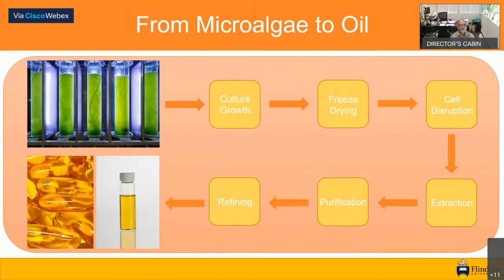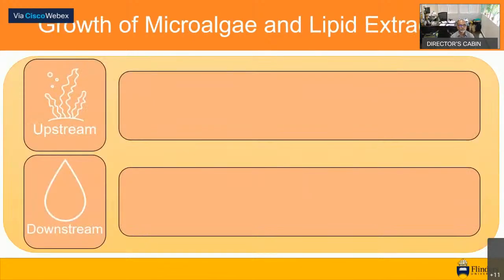We will now be considering the most important of these steps in more detail. The main stages of lipid extraction are split into two categories which are often analysed and optimised independently in the laboratory. These are upstream processing, which focuses on the accumulation of biomass and lipid, and downstream processing, which entails the extraction and analysis of fatty acids. Both are vital to receiving large yields of valuable fatty acids.